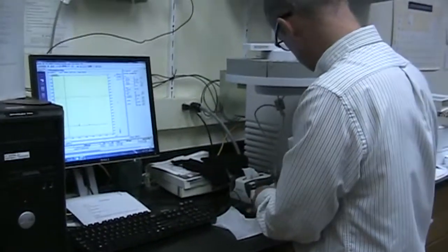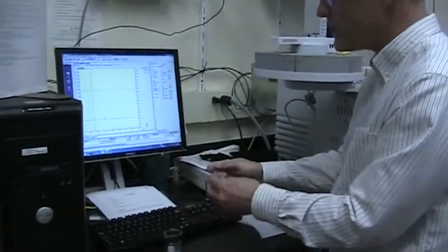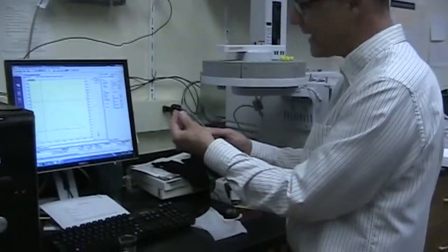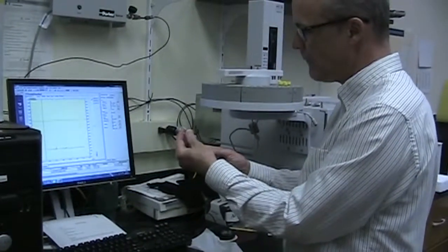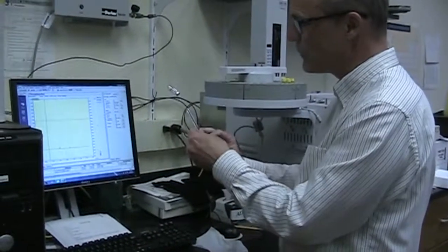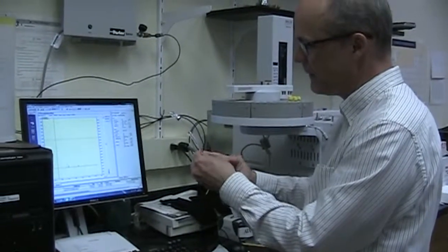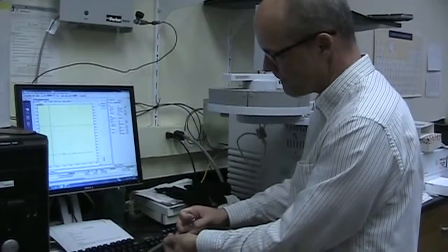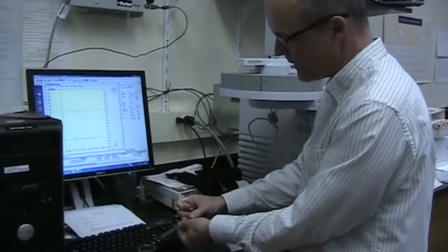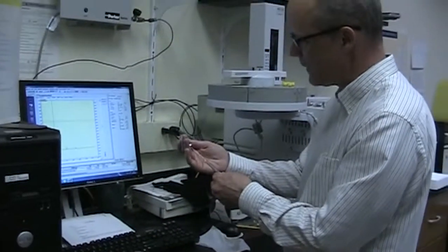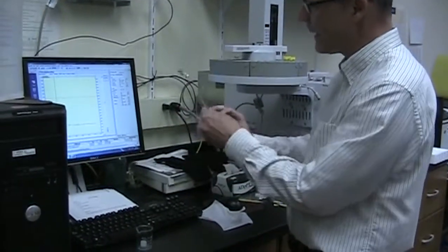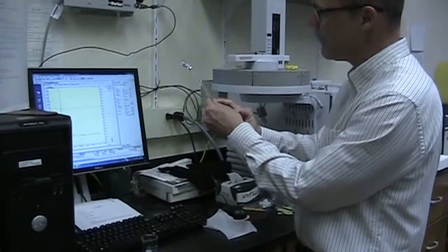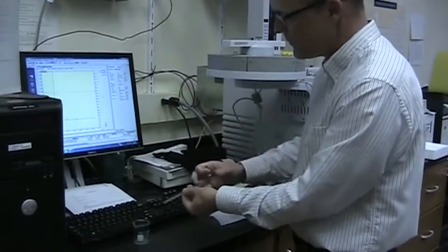Typical procedure here when you're injecting something or using a piece of glassware of any type: not a bad idea to rinse with the next sample. So I'm just going to fill the syringe mostly full. This particular sample is not hazardous. I'm just going to put it in a waste beaker. We do that a couple of times. So always rinse with the sample that you're about to inject.